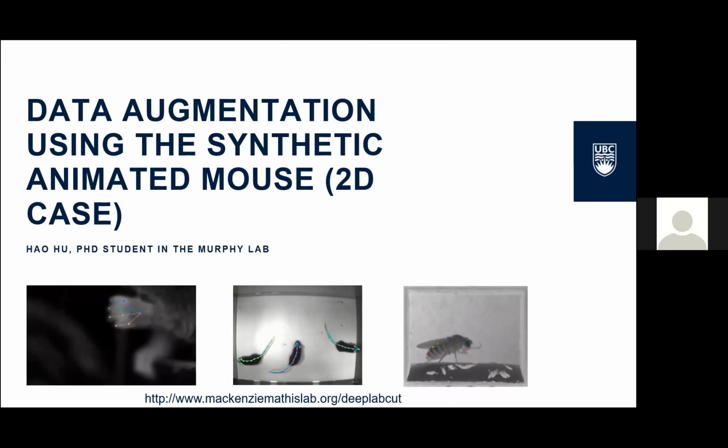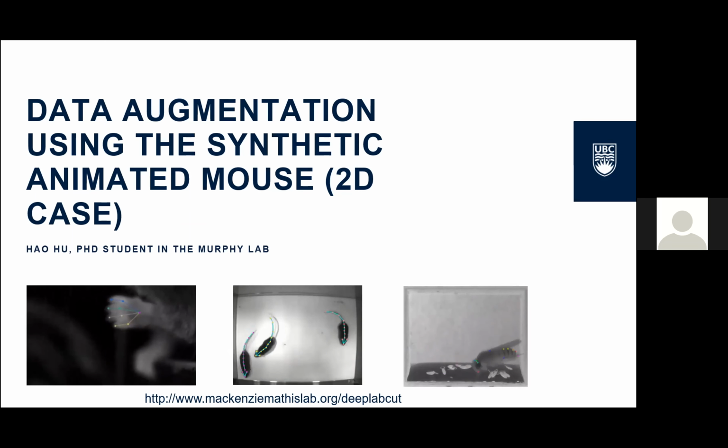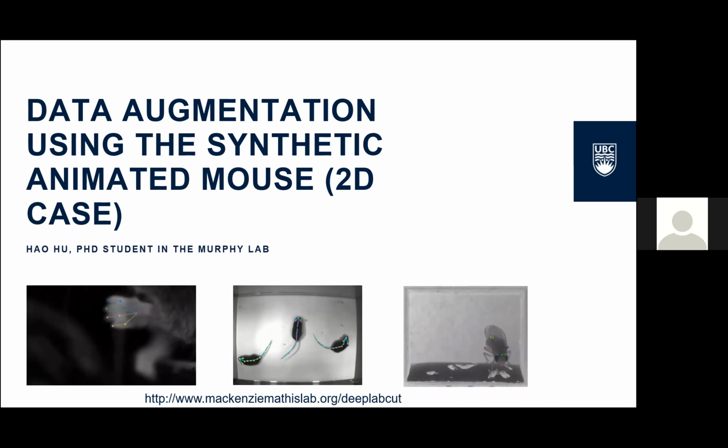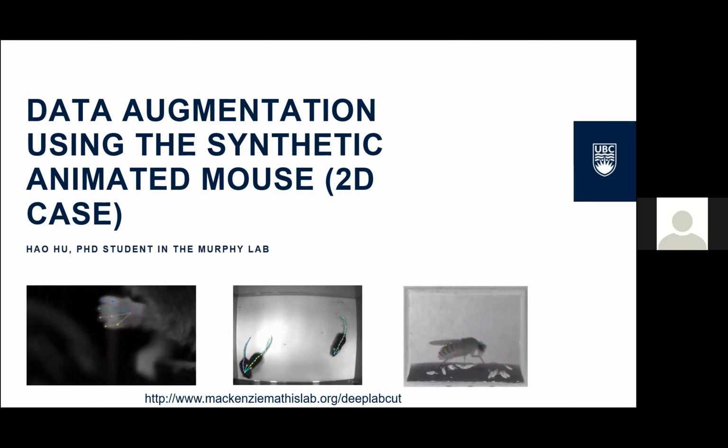In short, DeepLabCut is an accurate and flexible toolbox. It can identify various body parts in multiple species and multiple behaviors, if you provide it enough training data.